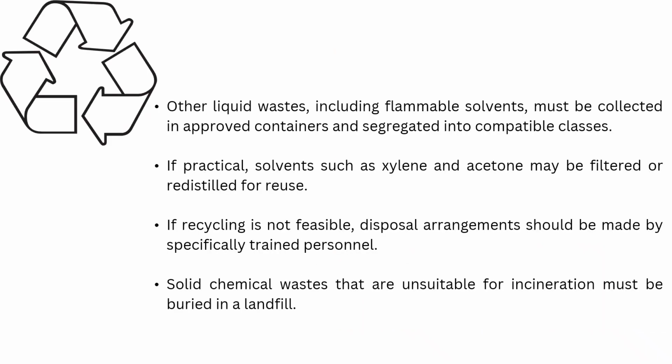If practical, solvents such as xylene and acetone may be filtered or redistilled for reuse. If recycling is also not feasible, disposal arrangements should be made by specifically trained personnel. Flammable material can also be burned in specially designed incinerators with afterburners and scrubbers to remove toxic products of combustion.